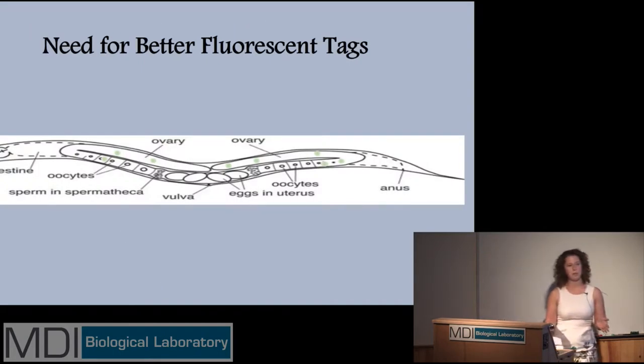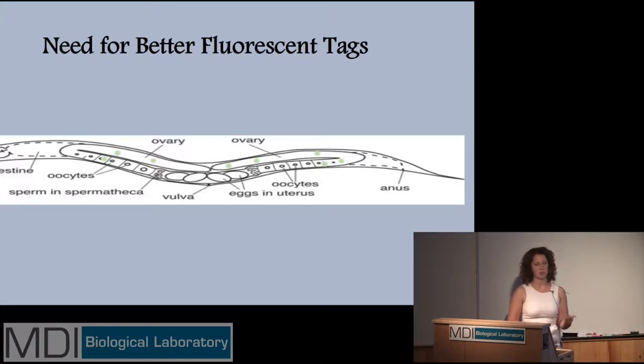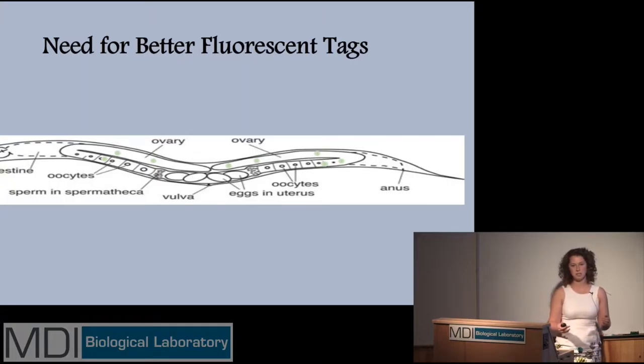In biology, when we want to study a protein component or cellular component such as P granules, we first need to be able to see them. So we do this by adding fluorescent proteins. In the past, there's been no way to edit endogenous genes in C. elegans, so we've had to inject plasmids carrying lots of genes to try to get fluorescent tagging on our proteins.